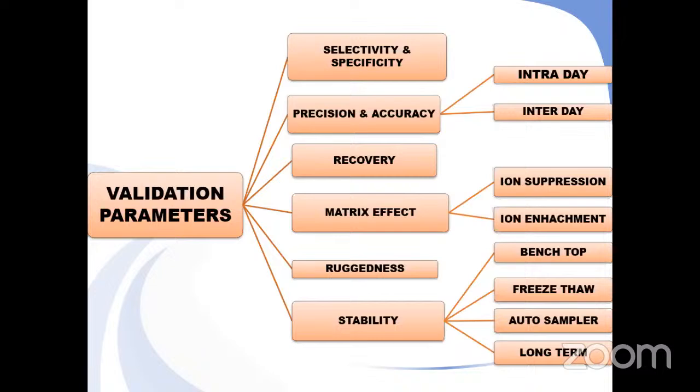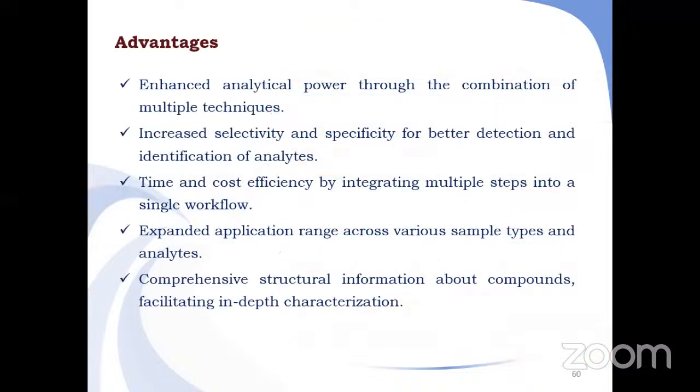So in the slides, we saw the applications of the LCMS, and advantages and disadvantages are also there for every analytical method. Hyphenated techniques are advanced and sensitive methods, so they definitely have major advantages: enhanced analytical power through the combination of multiple techniques, such as LCMS and GCMS. These give increased selectivity and specificity for better detection and identification of the analytes.